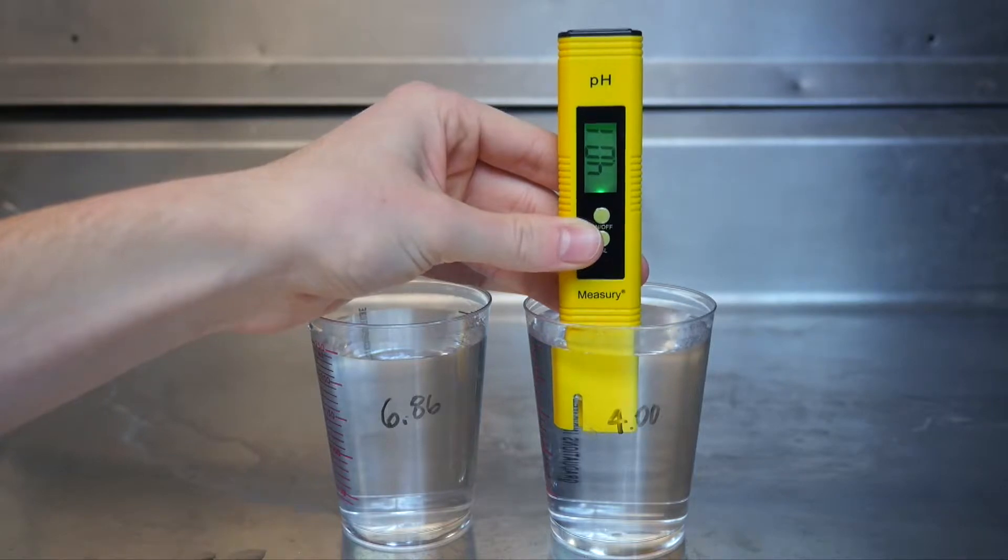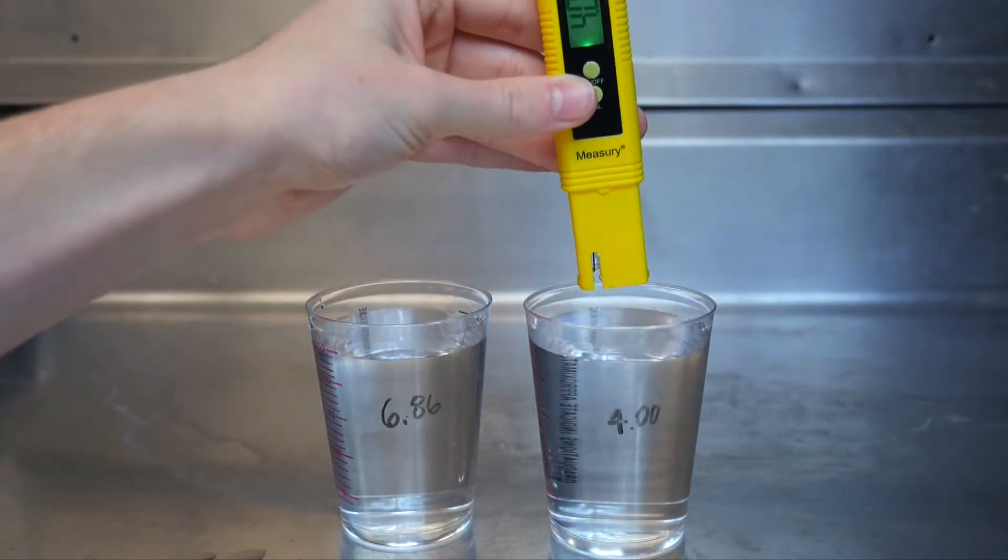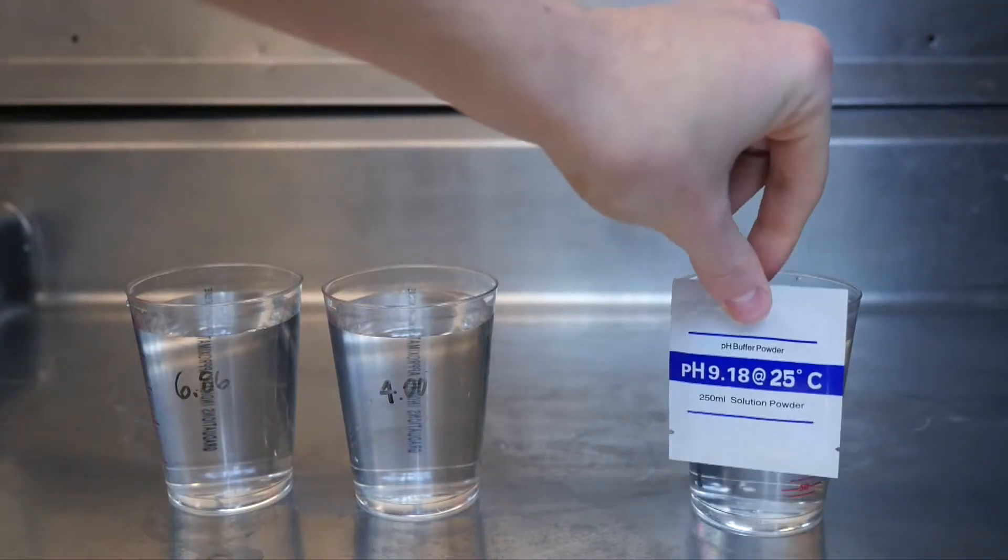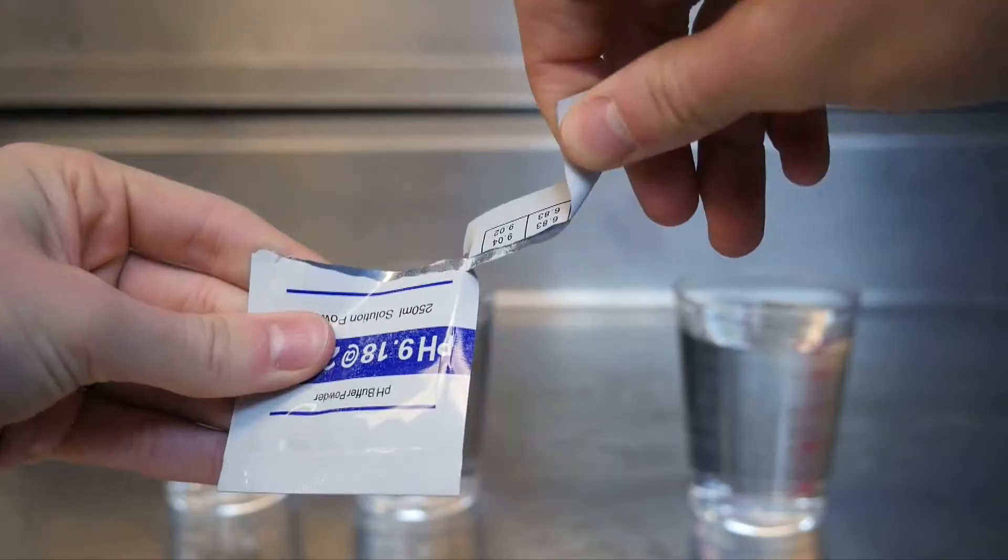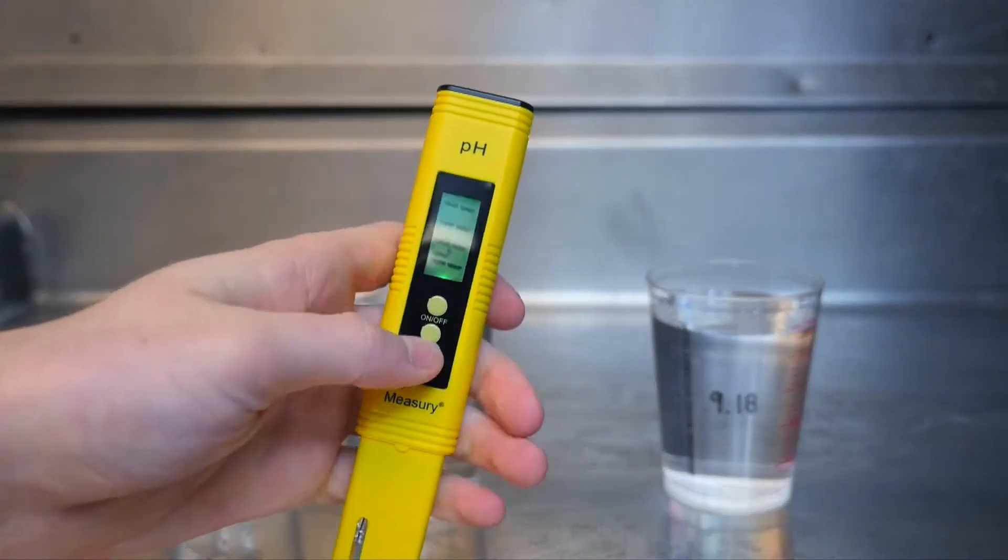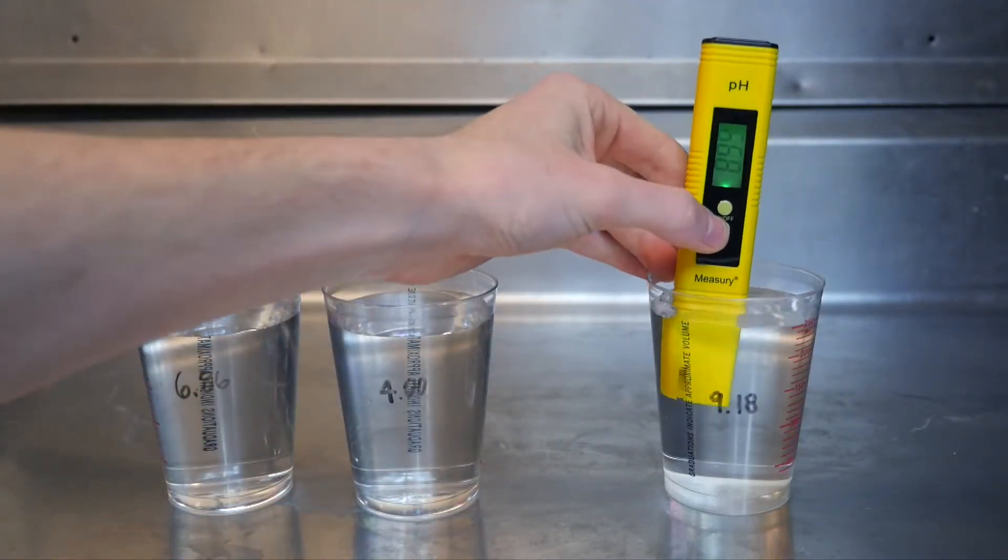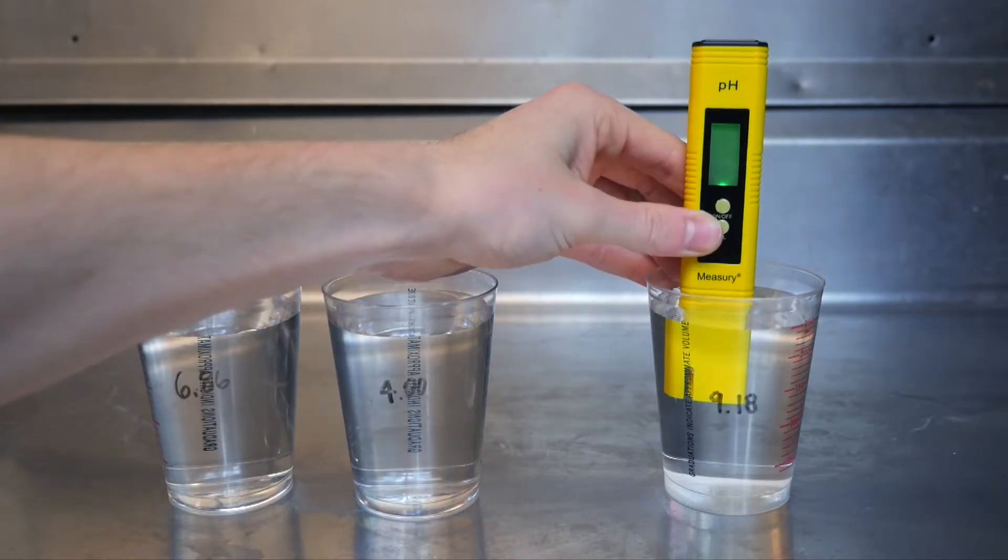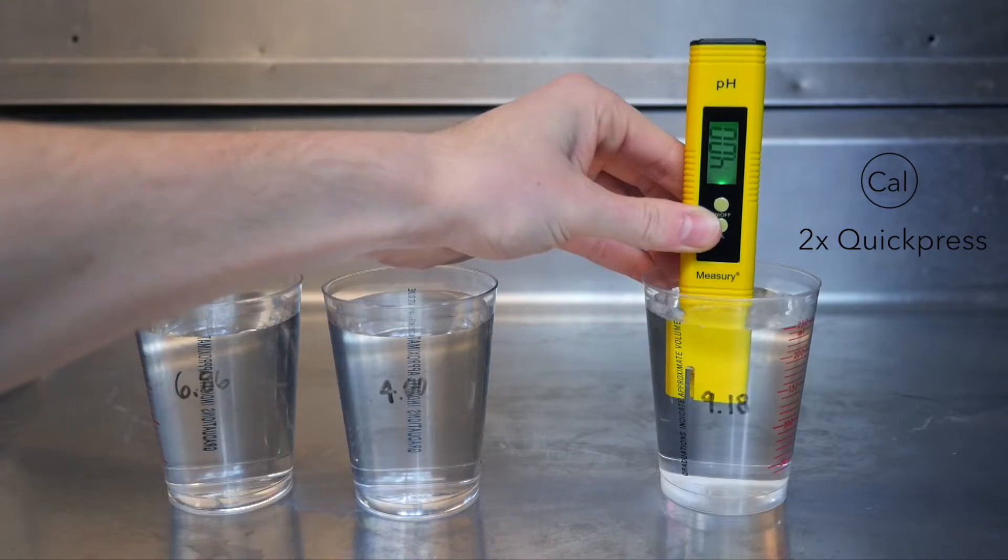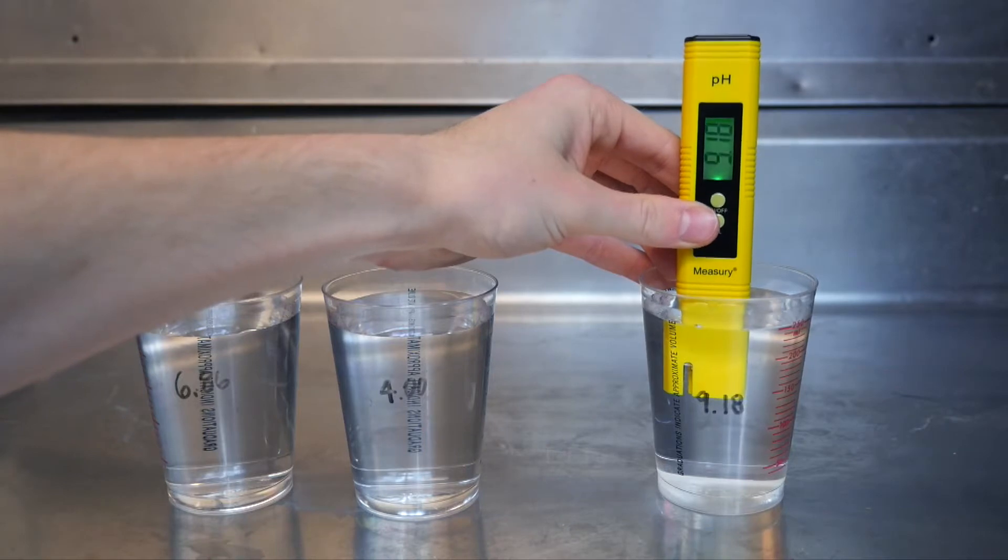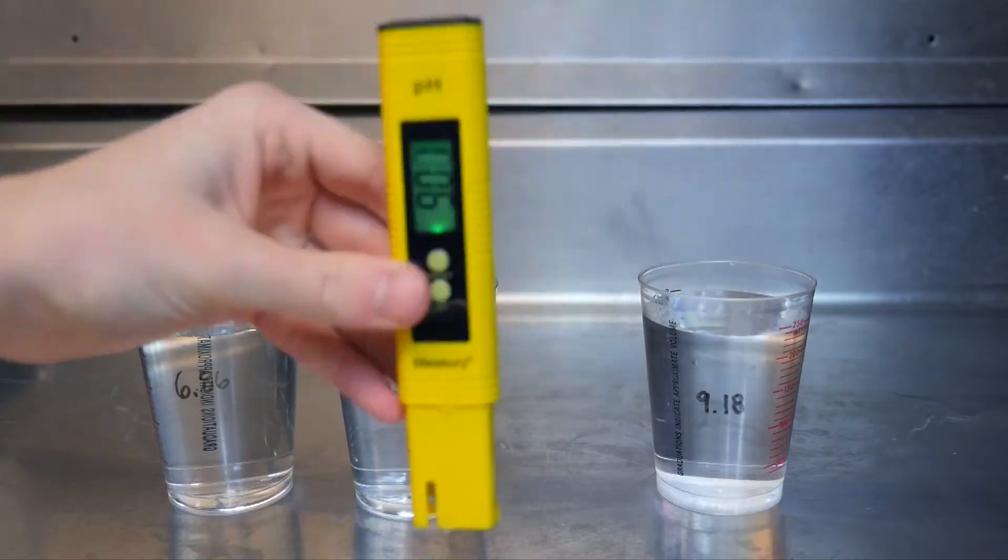Now, you may be done calibrating the unit here, but if you're going to be using this meter to test solutions that should read above 7, then you must do one extra step using the 9.18 calibration solution. Insert the meter's electrode into the 9.18 pH solution. Press and hold down the cal button for five seconds. After you release the button, you will see a number flashing. Quick press the cal button two more times and then 9.18 will be the number flashing. Wait for it to stop flashing and now your pH meter is fully calibrated to test solutions that have pH readings above 7.